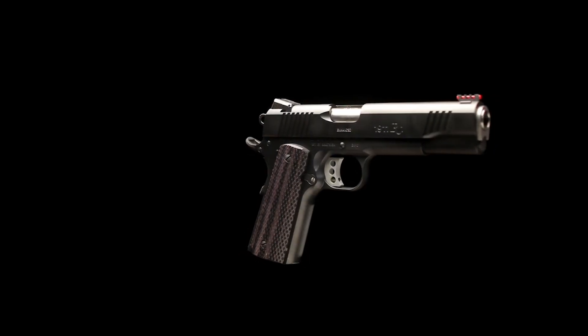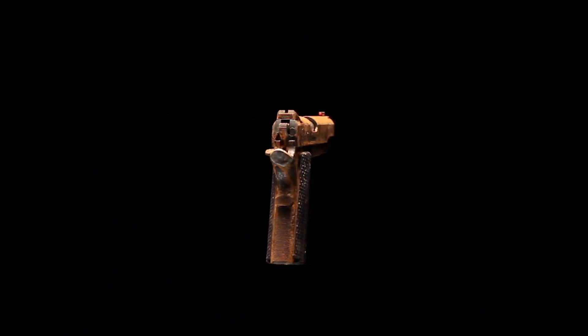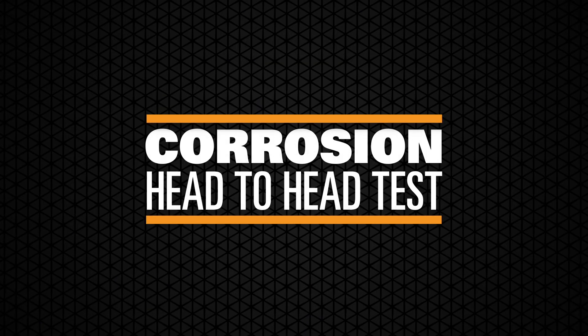The average firearm owner deals with corrosion more than any other finish-related problem. You are about to see what happens when Cerakote goes head-to-head in a salt chamber test against seven competitive finishes.